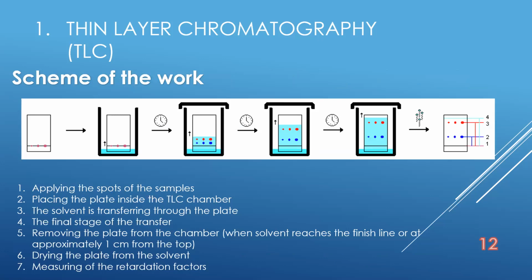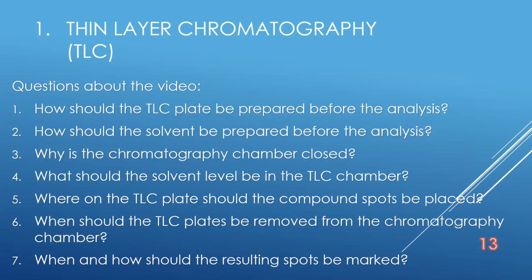So you also could find here the scheme for this work. The next slide is the presentation for this work, showing how the method is carried out step by step as shown in the video, and the questions about the video, which are concerned with some techniques performed in the video. And finally, that's it for today's work.